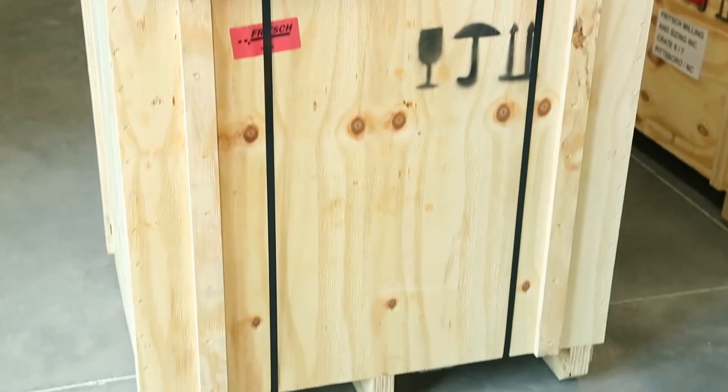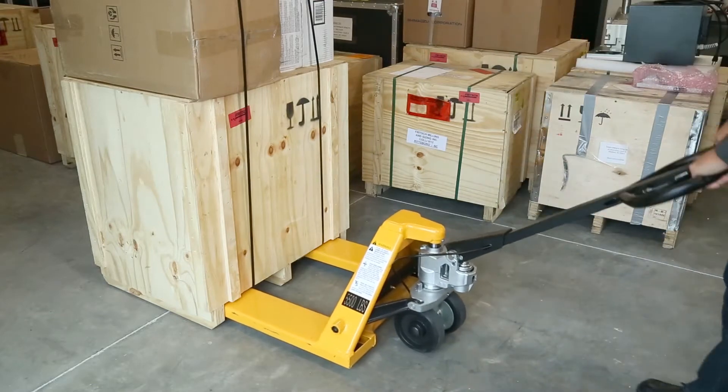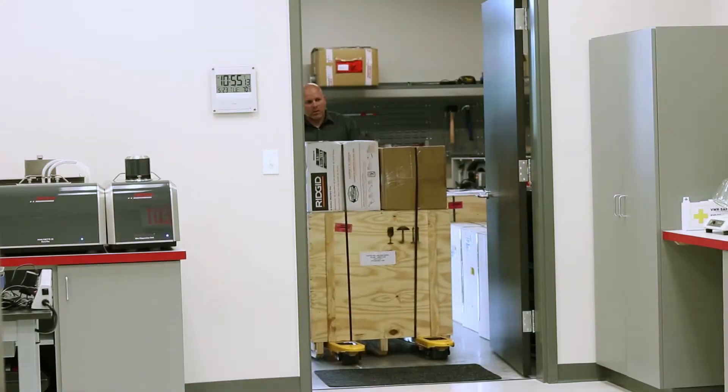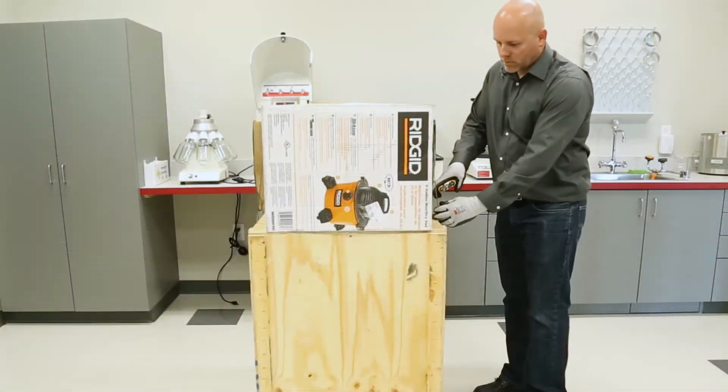Congratulations on the purchase of your new Fridge Pulver Asset 19 Universal Cutting Mill. You are about to experience precision milling at its best. This video will demonstrate the proper procedures to unbox and assemble your P19 mill.